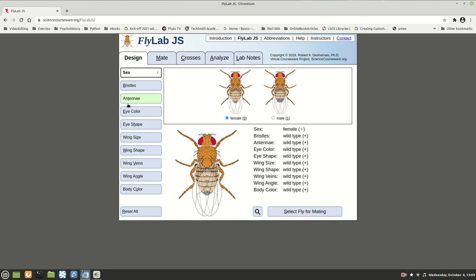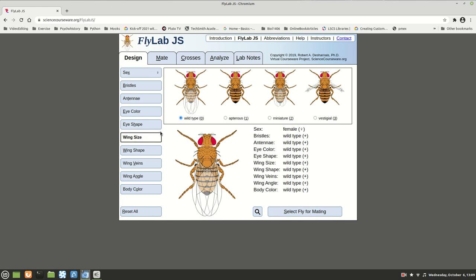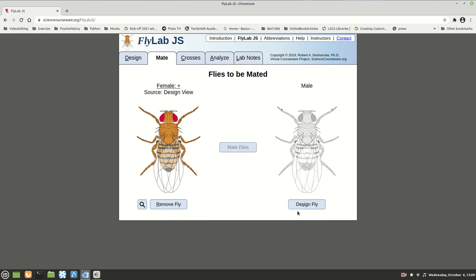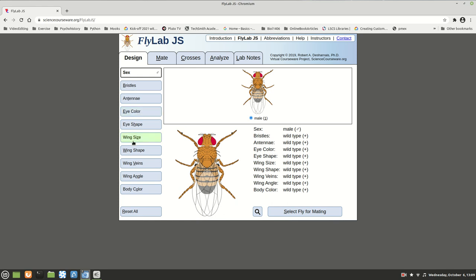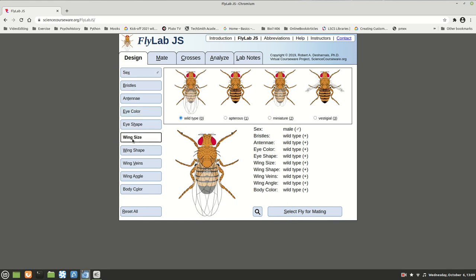Now I'm going to use wing size. We're going to take wild type again — so this one would be big T, big T — and select that one as our female. Then I'm going to design another fly and cross it with, let's say, little t, little t. These are vestigial wings — they're barely there — and we'll see how they're all kind of wrinkly. So we're crossing big T, big T with little t, little t.